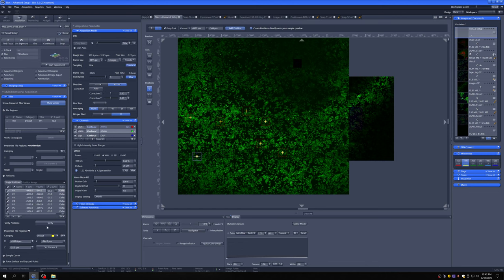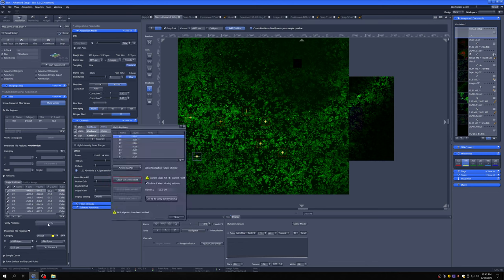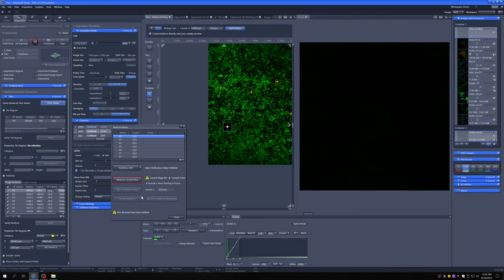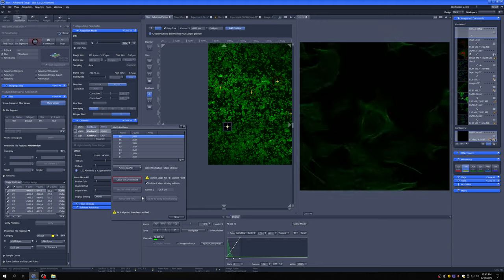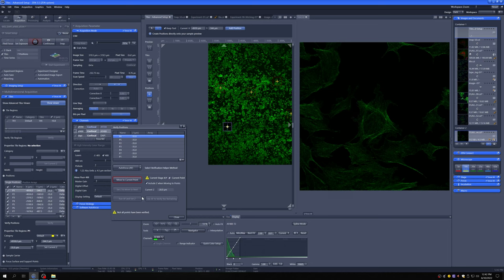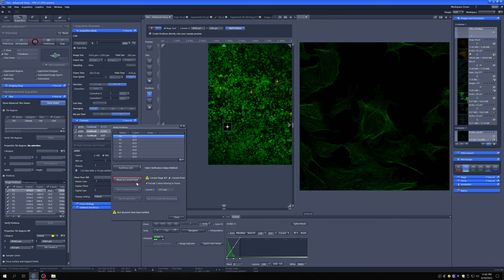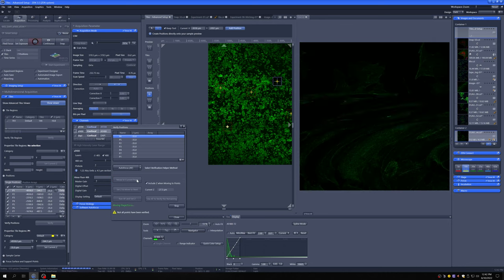we can go to verify and use live. And so we can adjust the focus. And move to the current point.